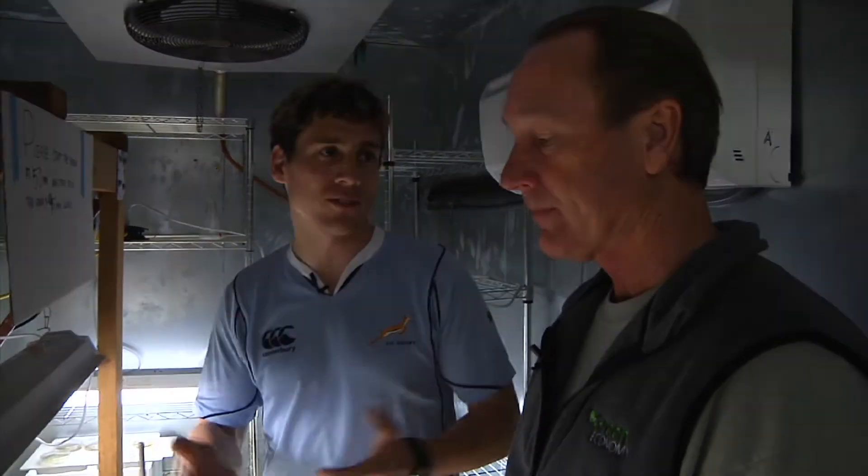So this is all part of the testing, extremely important. We got to know what happens here first before you go to a larger scale. Yeah, bottom line. Exactly.